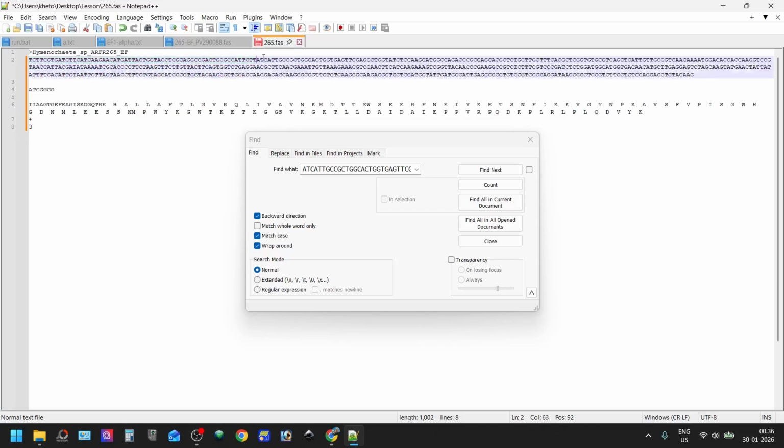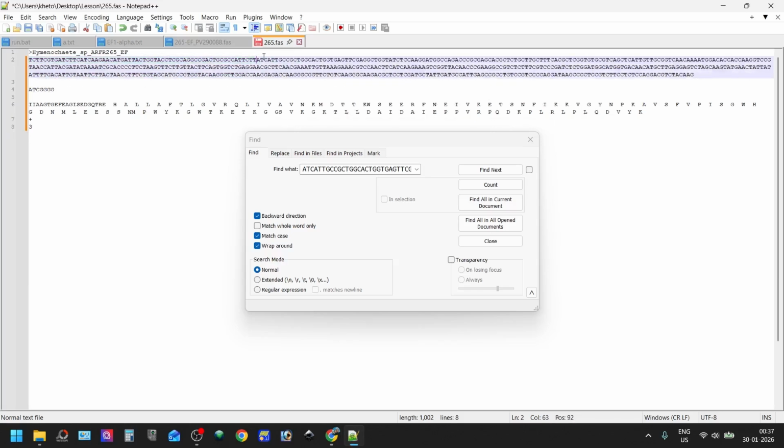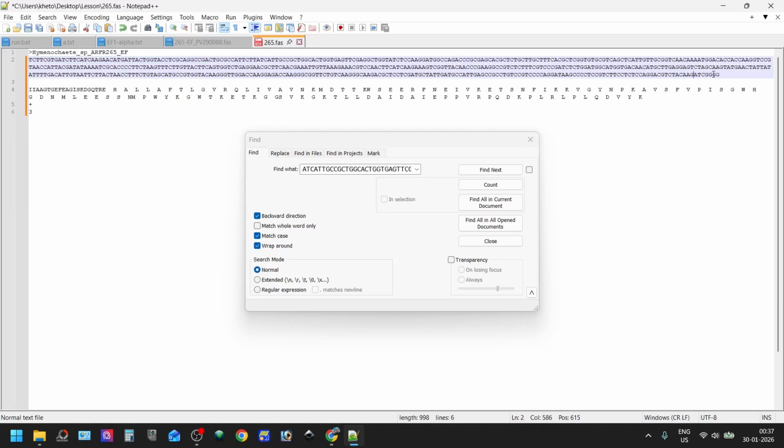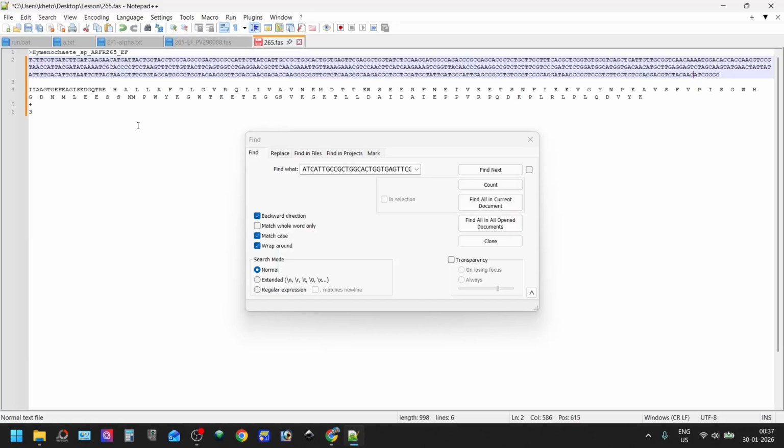It's easier, you can submit it, you will get the accession number. Those people who are working on proteins and need specifically the amino acid sequences will need to work this region out by themselves. You can submit this in GenBank and they will accept it because this is true. So now we have our protein coding sequence, and that is this portion.